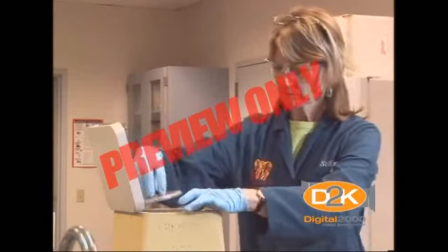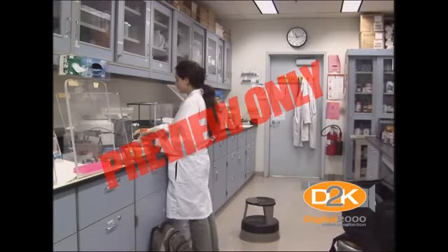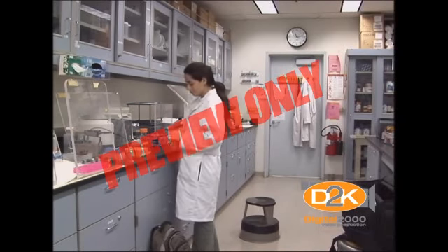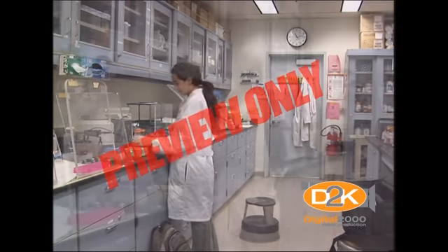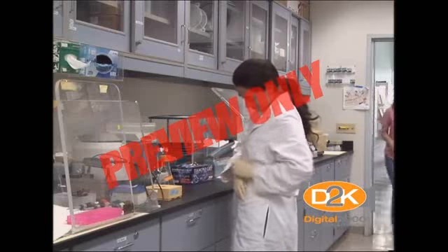Although NRL gloves have become the material of choice for hand protection in many universities, some people have reported certain irritations and/or adverse reactions associated with the use of these gloves. These adverse reactions typically manifest themselves in the form of irritation, delayed hypersensitivity, or immediate hypersensitivity. What should be done if you have experienced symptoms associated with an irritation?